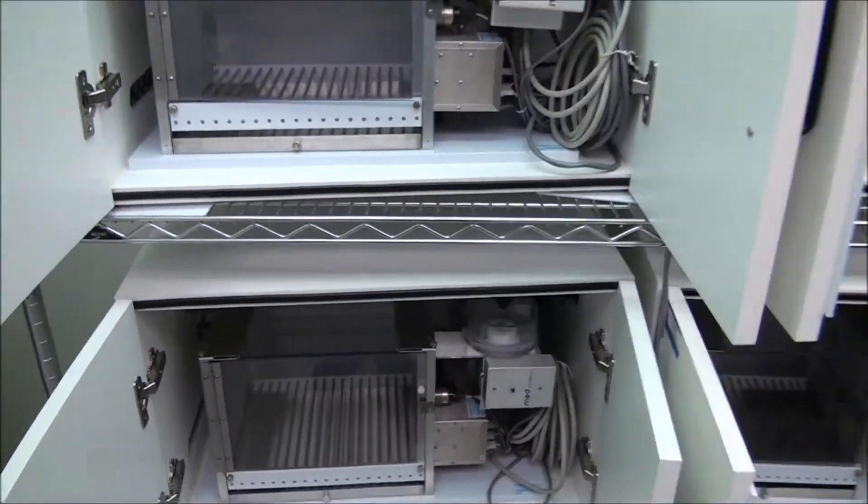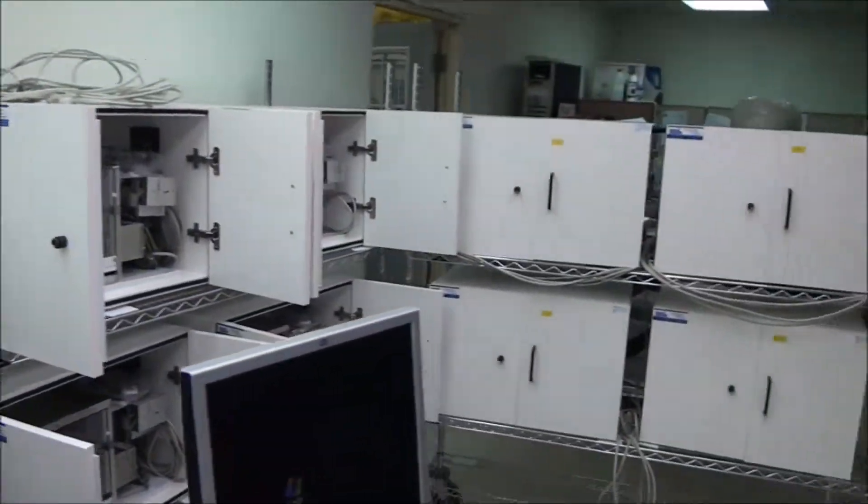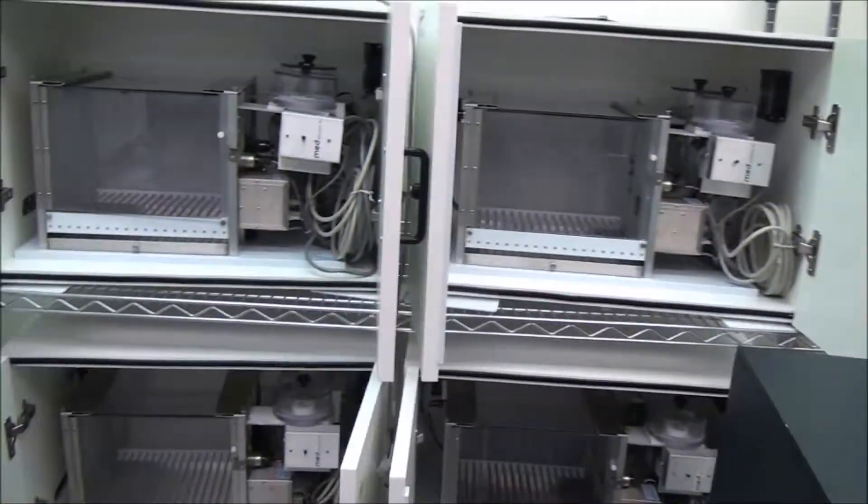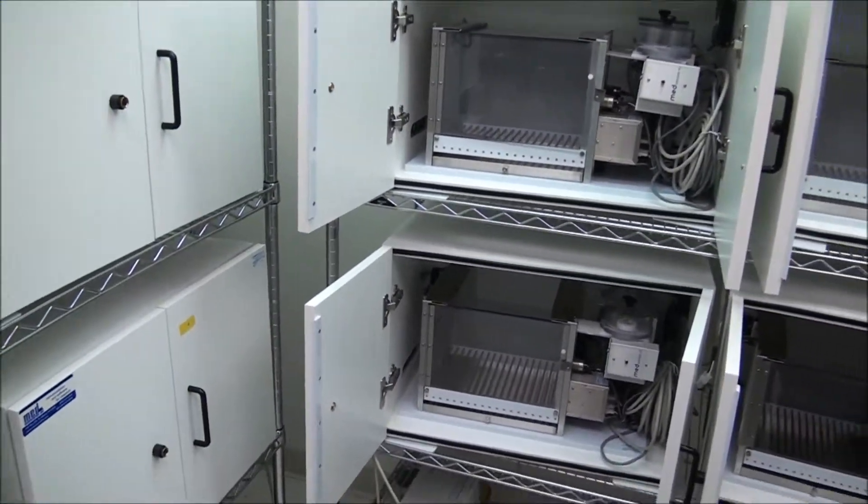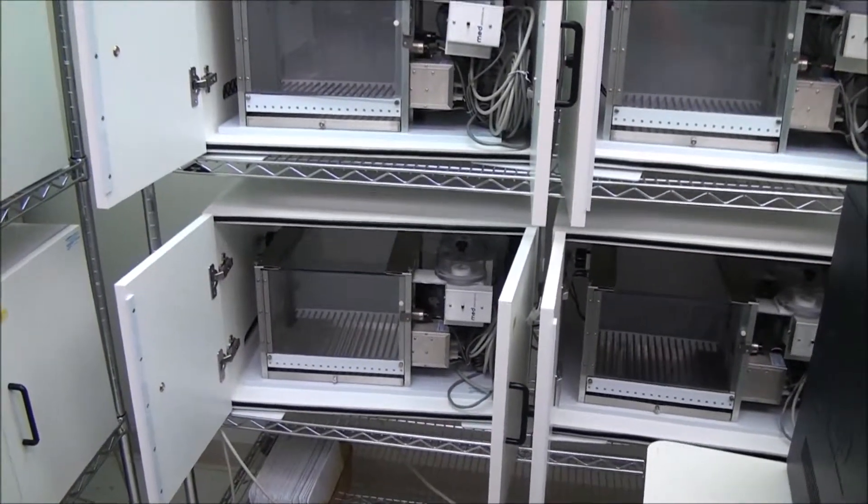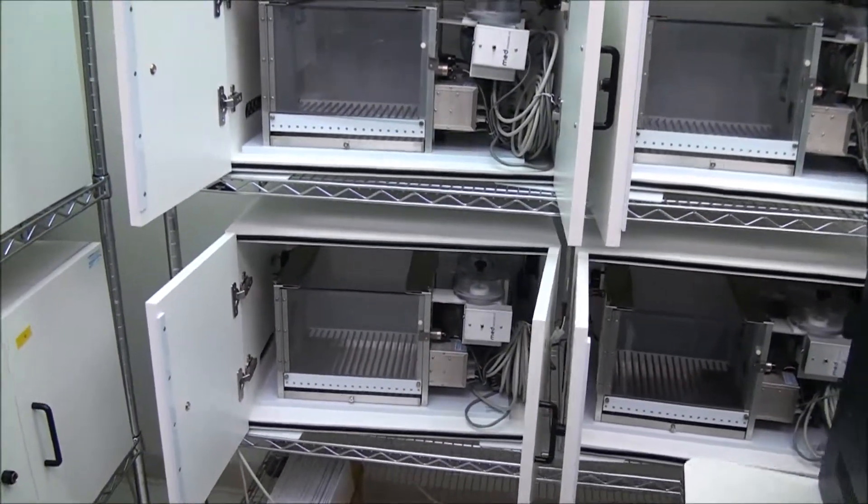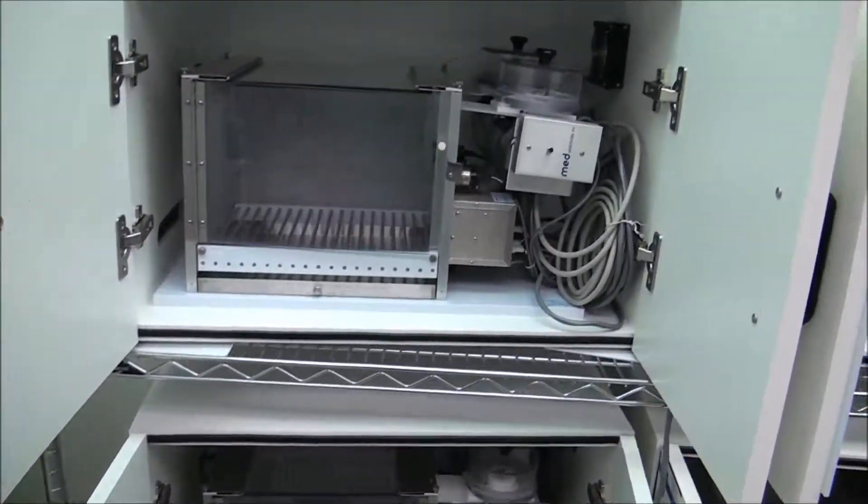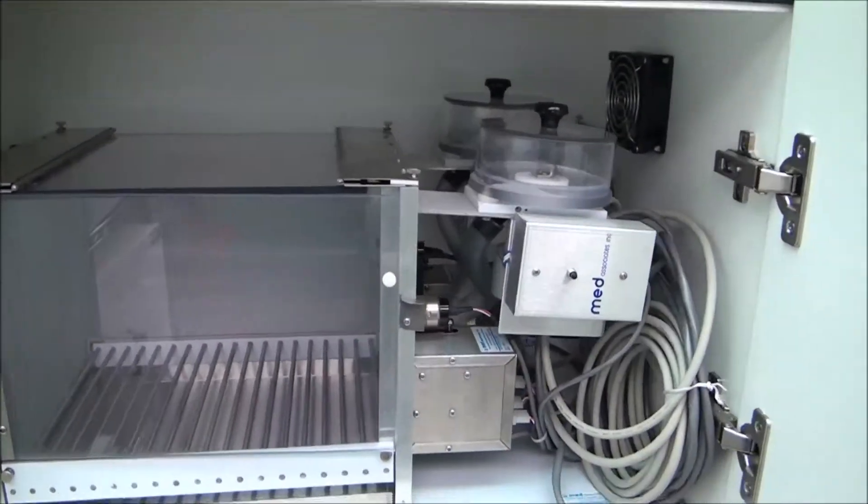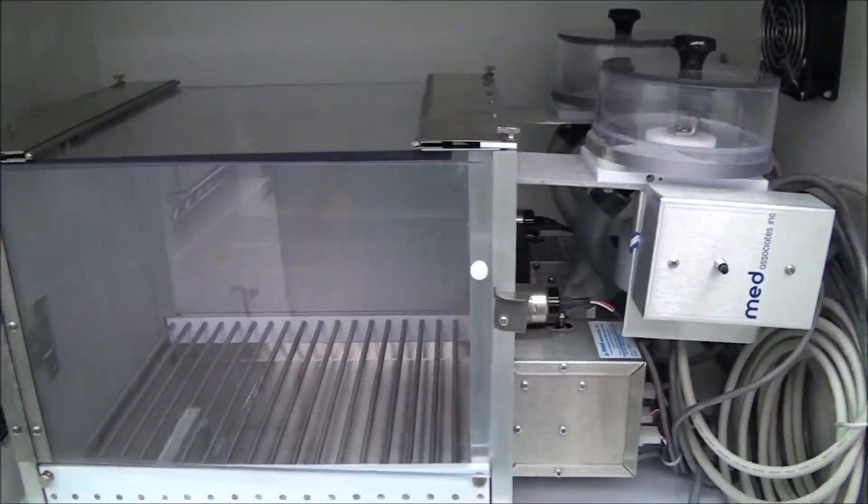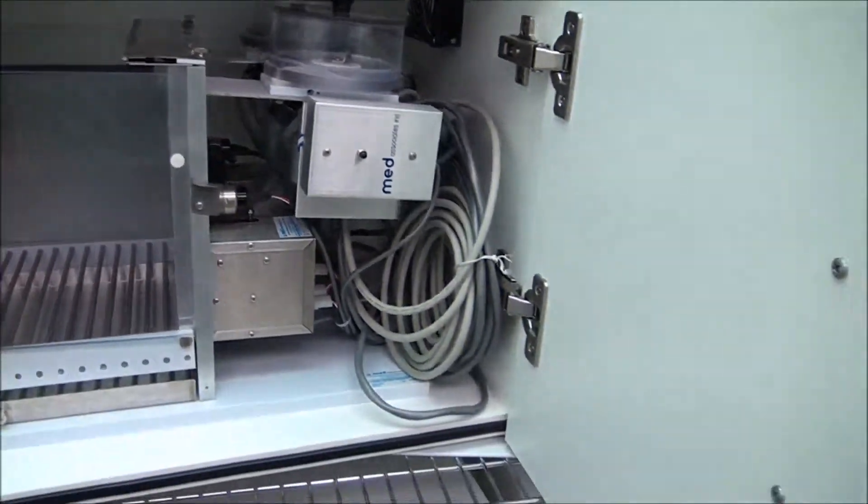And we have a huge system here, like I said, all the cables, everything turnkey ready to go. We've tested everything. Everything responds quite well. All the cages are in this pristine condition. All the pellet feeders are in great condition. Just a great set here.